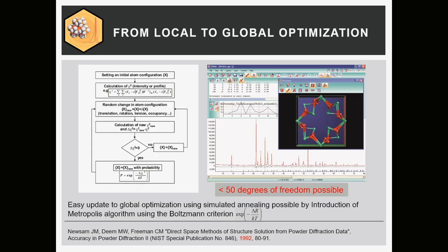And from this, you can actually calculate a chi-squared. You can call it an energy function, from the intensity, or even from the entire profile. Now we say the intensity, and you can ask, okay, how good is a completely arbitrary structure, which I throw into my unit cell? How well do all these peaks as a sum fit together? And of course, it's terrible. Or you're lucky, one out of 100 billion, found a structure, just one match. No, it's not working. So the computer puts it in, and then, of course, the computer is making changes.